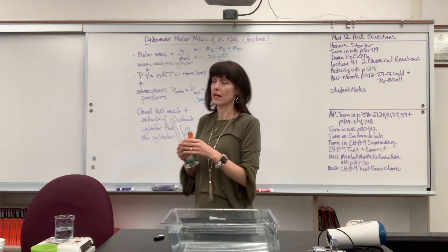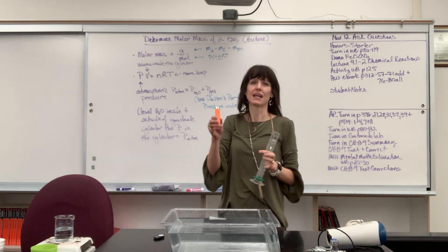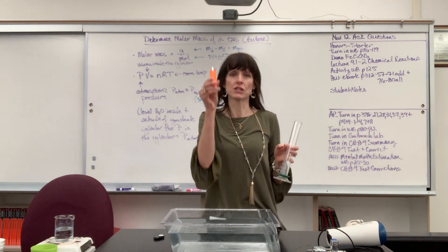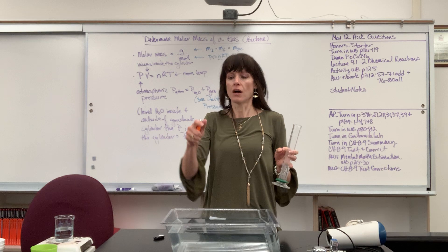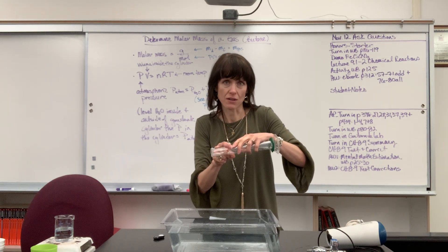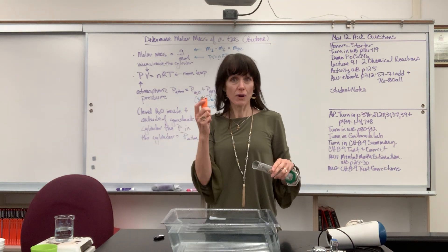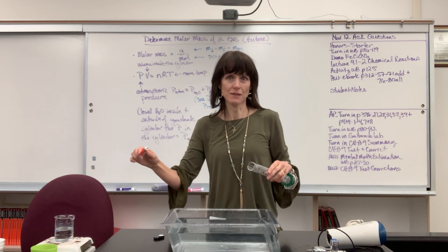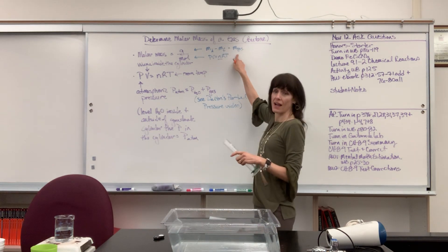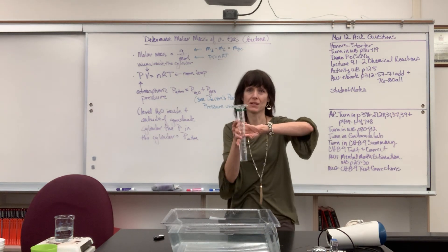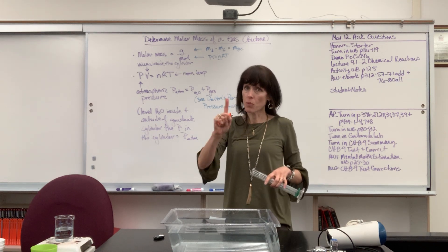We're going to do this two ways. Number one — to find the mass, I'm going to take the initial mass of this butane lighter. I'll release the gas into this container under the water, then I dry it and weigh it again. That difference was the mass of the gas that I put into the graduated cylinder.